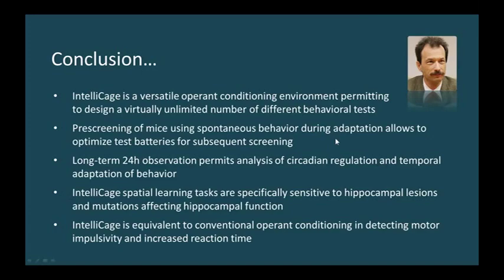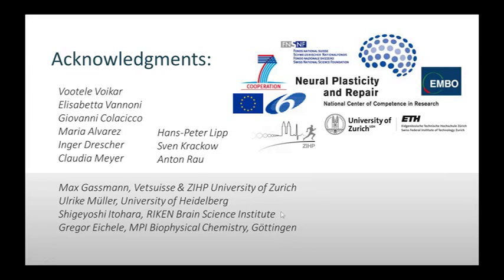So with this, I would like to end my presentation and come to a summary. I hope that I could convince you that we can use this IntelliCage system for very different behavioral phenotyping applications, starting with the observation of spontaneous behavior and moving on to more specific tests that address specific domains of cognitive function. To end, I would like to acknowledge my collaborators and partners in the experiments that I showed you, and also our funding sources. Well, that's it from my side.